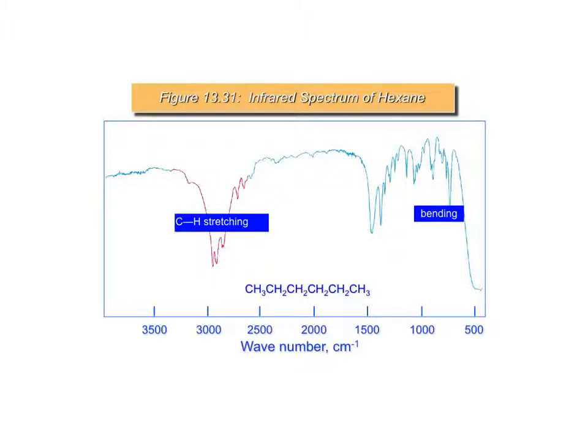Okay, so that being said, this is what it's going to look like for what's called FTIR, for Fourier transform. It's just a mathematical way that they measure and view the bending and the stretching that's occurring. They didn't show the y-axis here, but this would be percent transmittance, presumably, because it's going down.